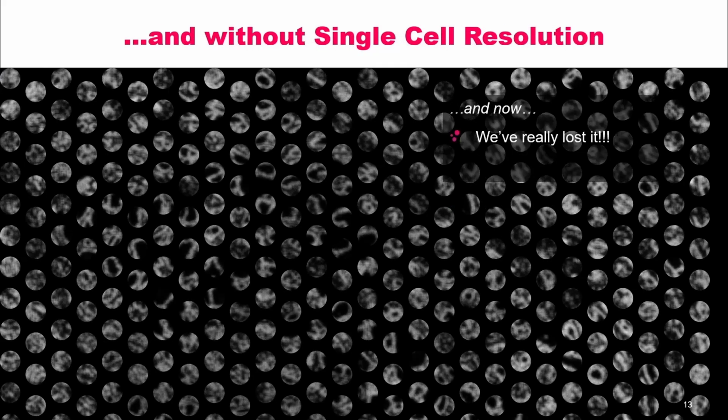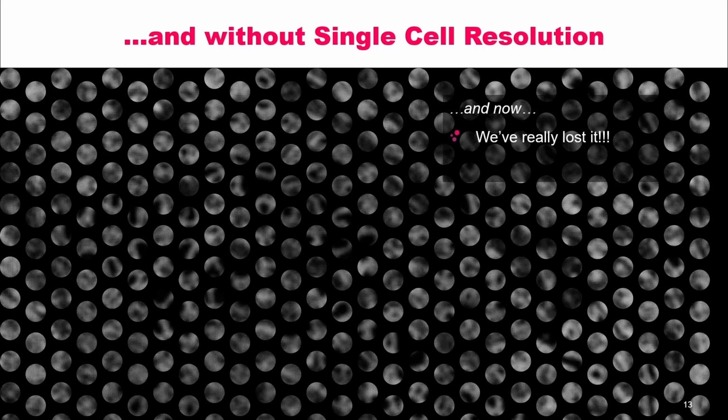On top of that, region of interest grid-based methods average the biomarker expression for each region of interest, thereby losing even more resolution. We are unable to accurately conclude what is happening in the tissue spatially, if multiple different cell types interact within each of the regions of interest, and even less so how they interact across regions of interest.